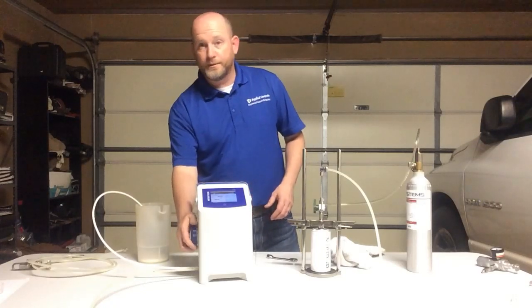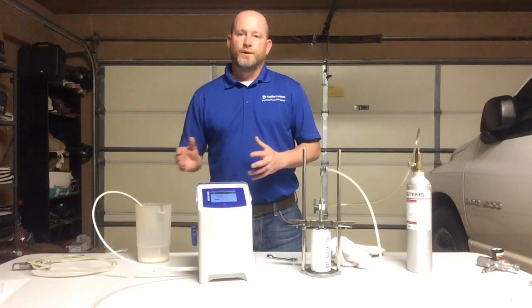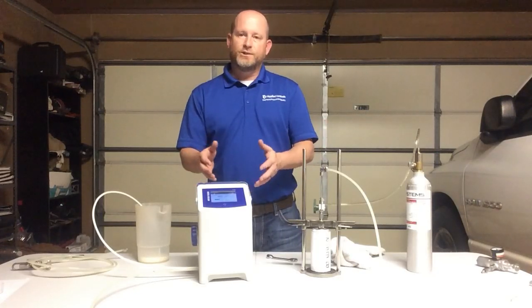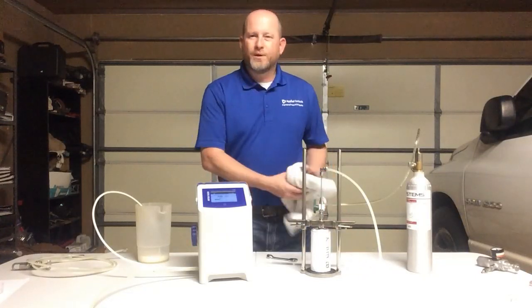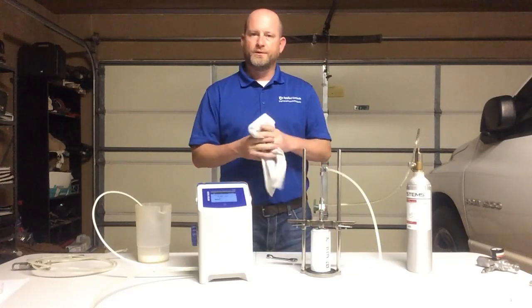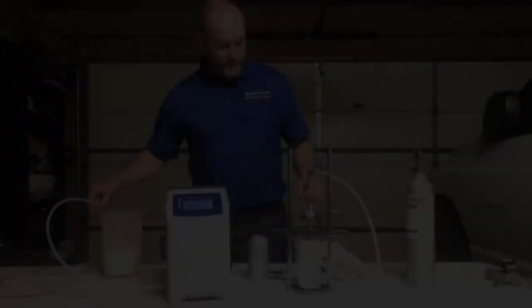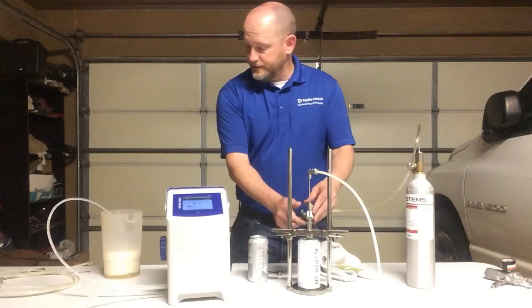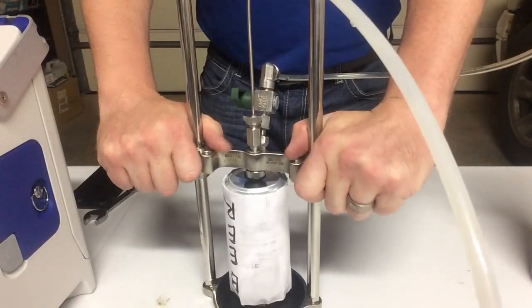I'm going to turn this knob up a little bit more. The first thing that we want to do is run a couple beers through there to make sure that the system gets adjusted internally to the temperature of the beer that we are testing. So you probably want to do about 2 beers, and you'd be ready to go and then start taking our readings. We're done, so I'm going to shut off my valve here. I'm going to open this back up.